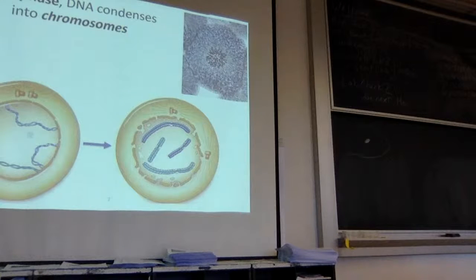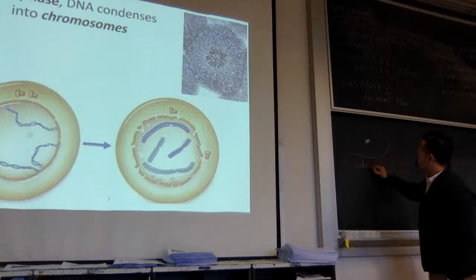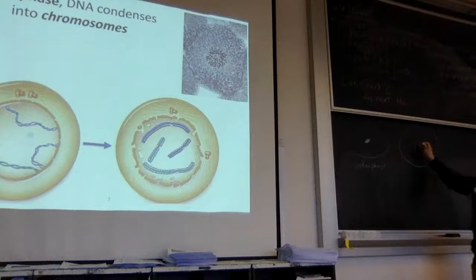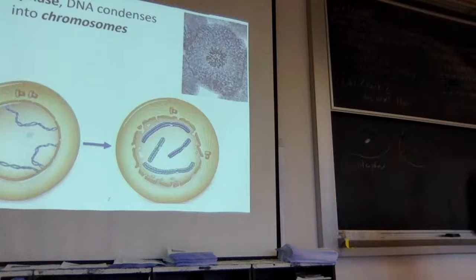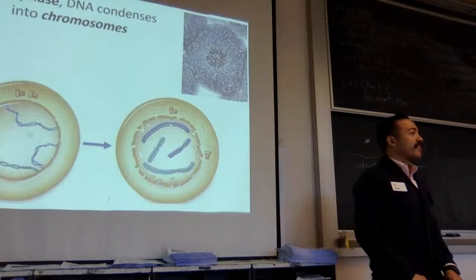Okay, so we've gone from just the blob of a cell with a dark nucleus, that's interphase. If we get into prophase, the nucleus looks a little bit different. I'm just going to zoom in bigger so you can see it a little better. When you look at the nucleus, what do you notice about what's inside of the nucleus? How do you describe its appearance?